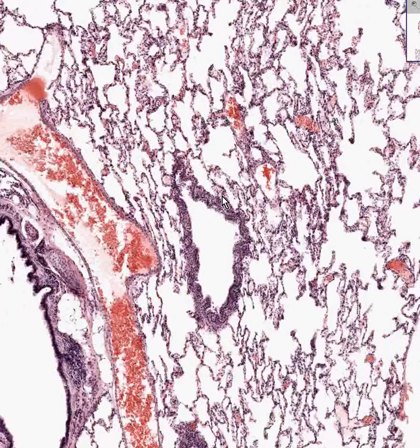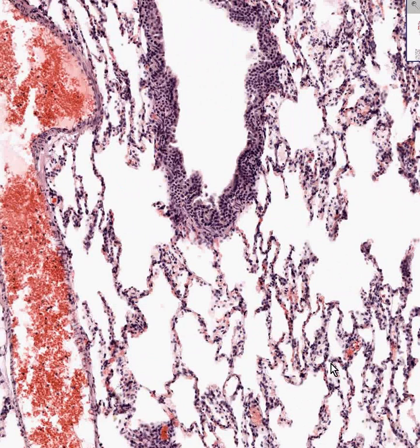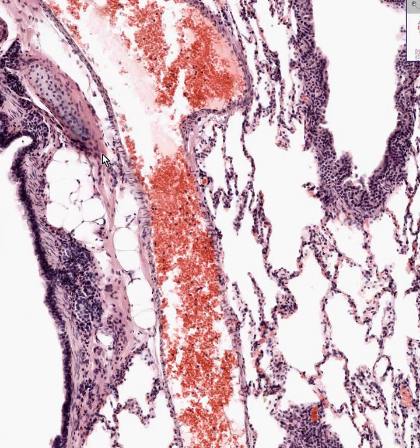When you get to the very lowest level of air spaces, such as here, these are alveoli. The majority of the cut section of the lung is nothing but alveoli. If you see an area where there is a common vestibule for groups of alveoli, you can call that an alveolar duct. Mid-portion between an alveolar duct and a bronchiole is a respiratory bronchiole, which are sometimes hard to find, and I don't think I want to waste my time trying to do it.